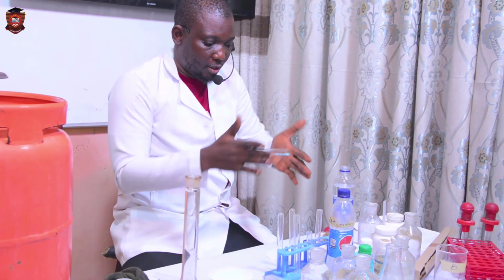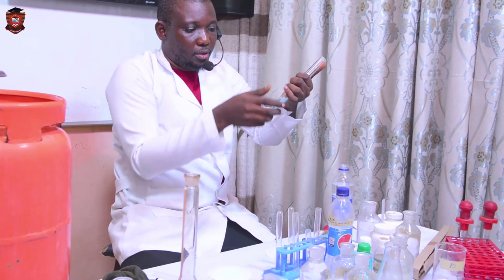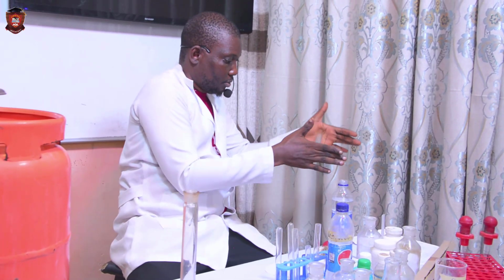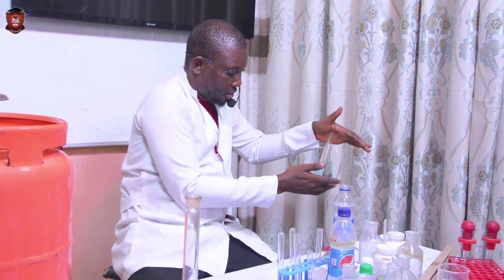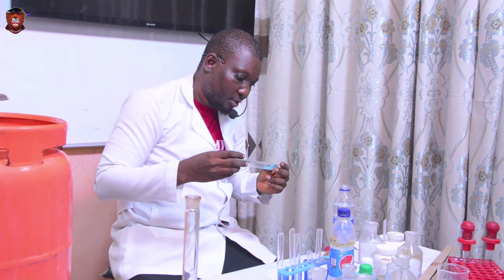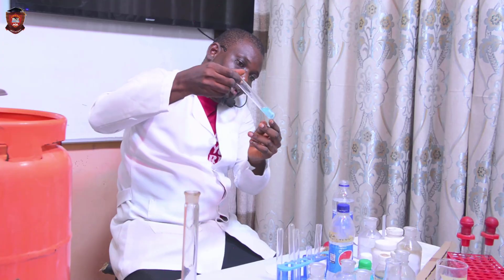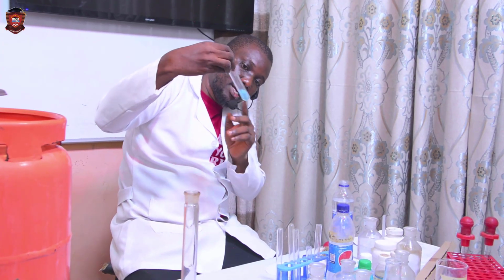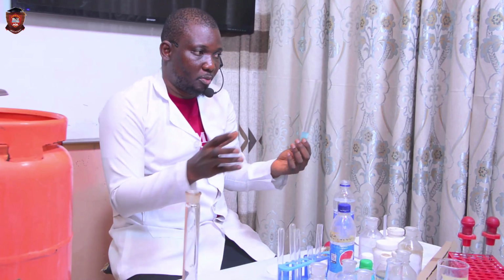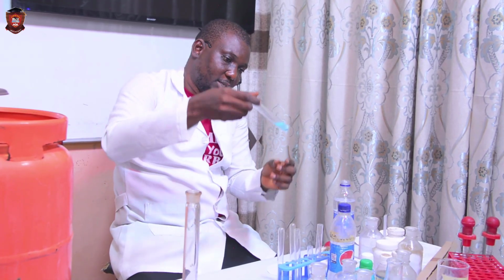You can shake to make sure that, see, you have to check because sometimes some soluble compounds require thorough shaking, for those of them that are in lump form. Because some are lump, in this case you need to grind using your mortar. There are some small mortars and pestles we have in the lab. I think they are dissolving now.